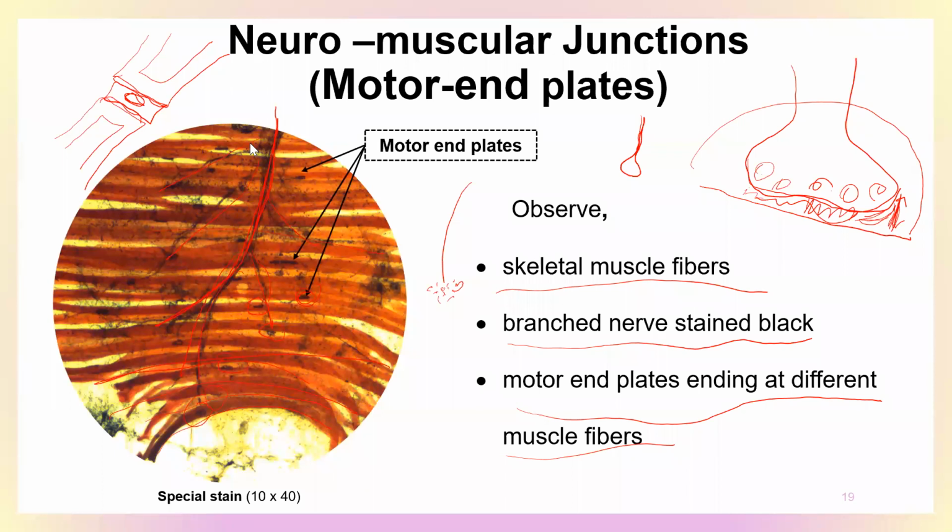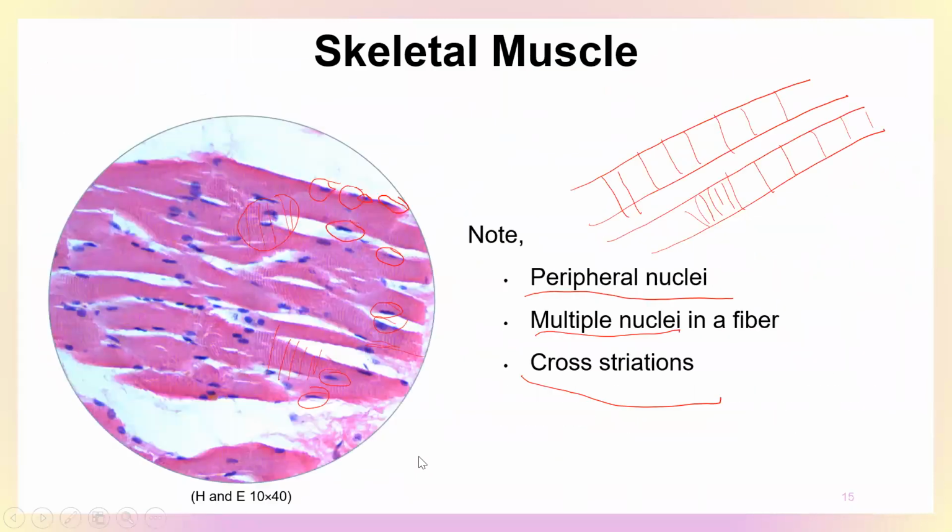Myofibroblasts are not active, but I think they have the ability to contract also. They have muscular properties also, right? That's why you call them myofibroblasts. Not active in that sense, okay? They have ability to contract, okay? Right, so someone wanted this one, okay?